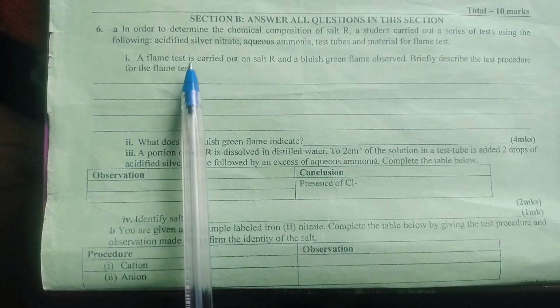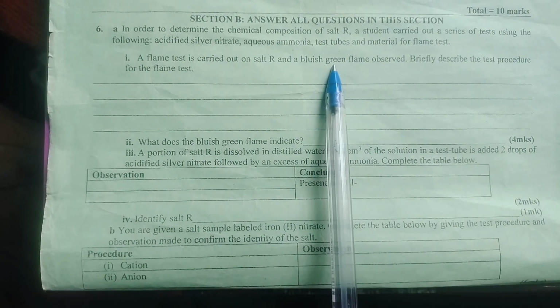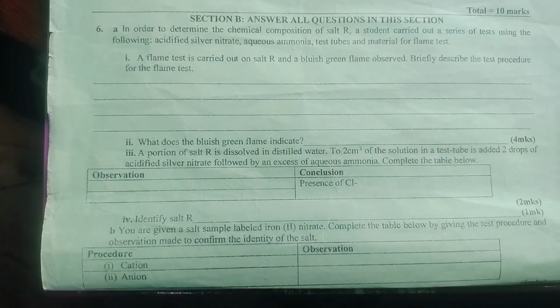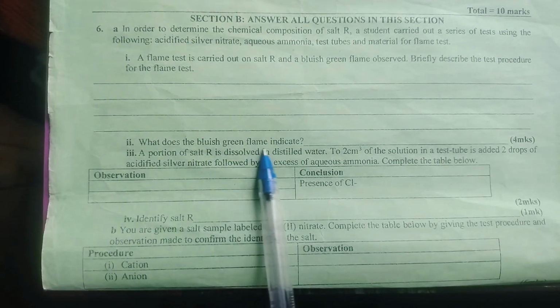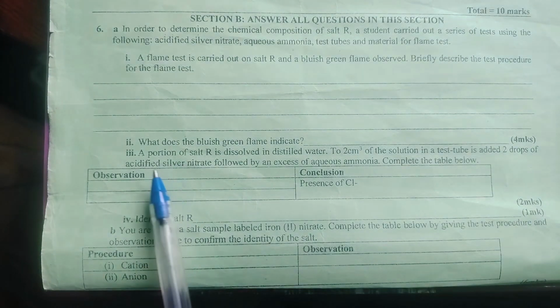Okay. 1. A flame test is carried out on salt R and a bluish green flame is observed. Briefly describe the test procedure. Procedure for carrying out a flame test, we have a video on that. If you haven't seen it, try and go over it. What does the bluish green flame indicate? When we observe a bluish green flame, that indicates the presence of a copper 2 ion.